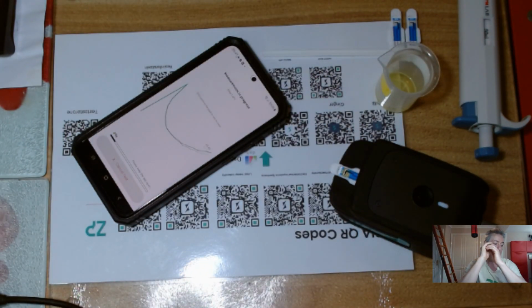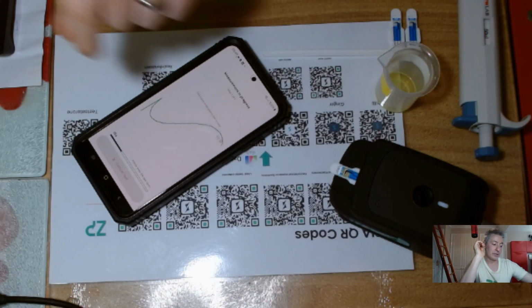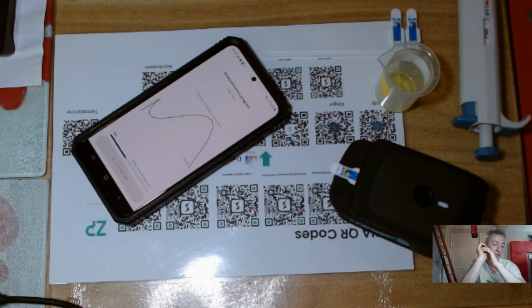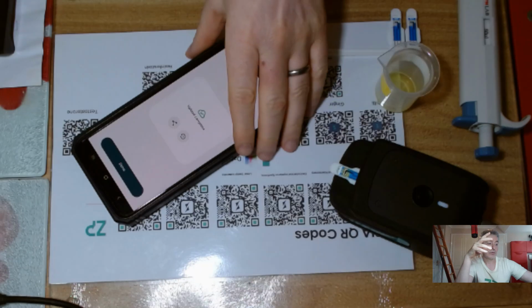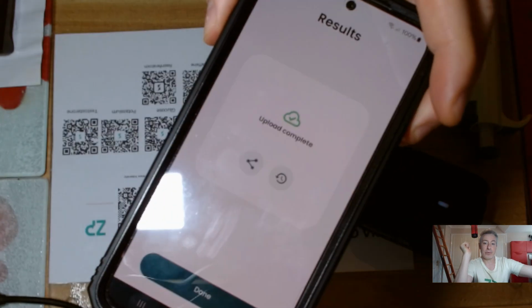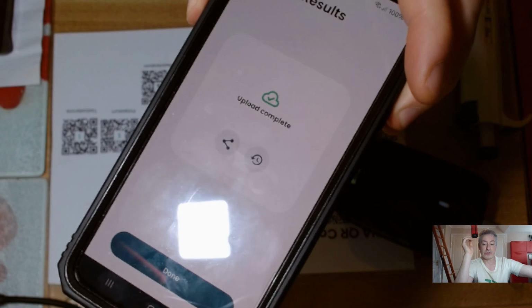Now, what I like about this potentiostat as well is I can already see that I'm going to get a nice signal because I can see the oxidation wave. What's happening is we started off at about minus 400 millivolts, so we actually reduced ferricyanide to ferrocyanide, and then we reoxidized it in the actual sweep. So that's why I get a wave for it. What it then says is upload complete, and I can actually share that now with whoever I so wish.